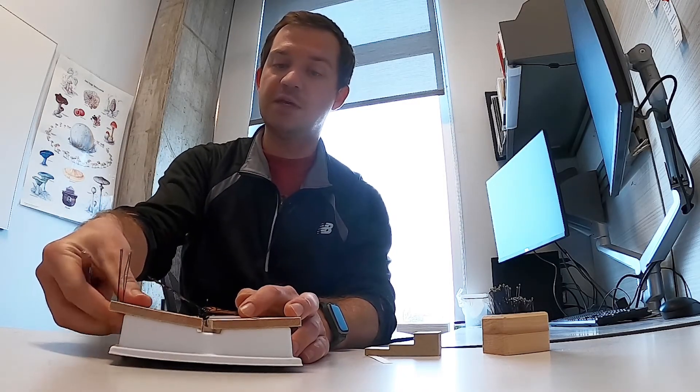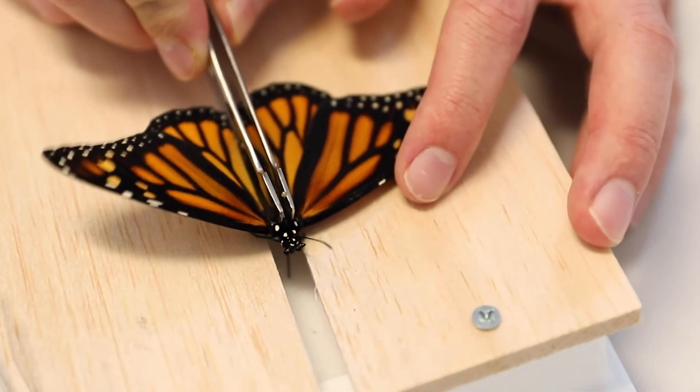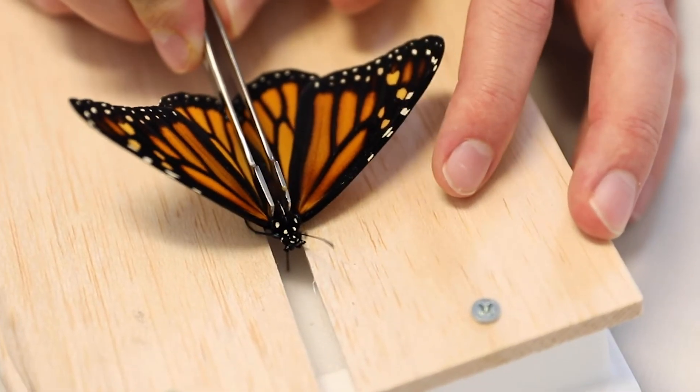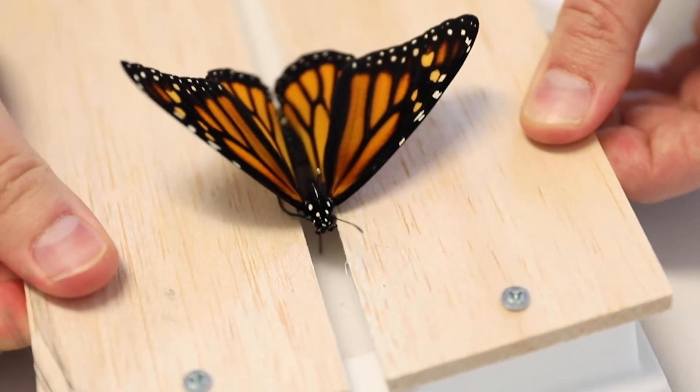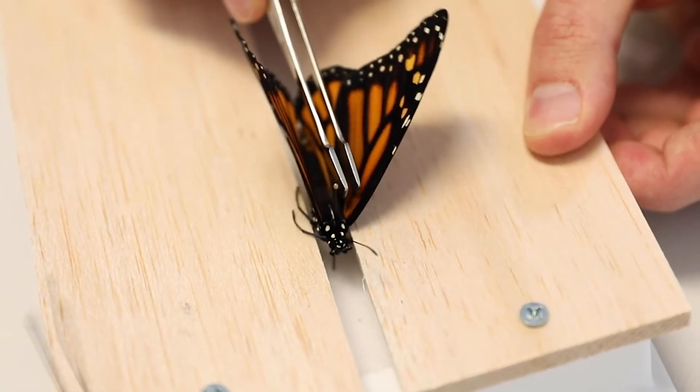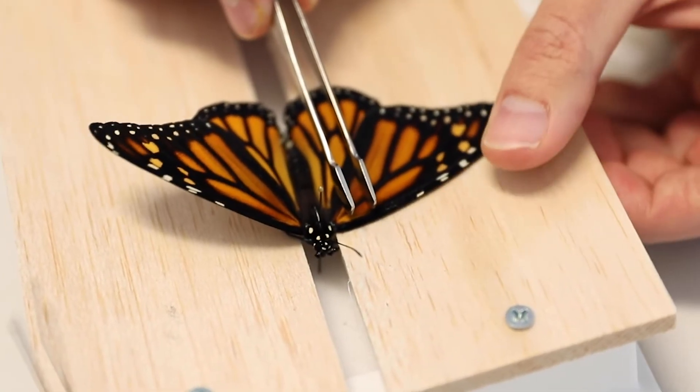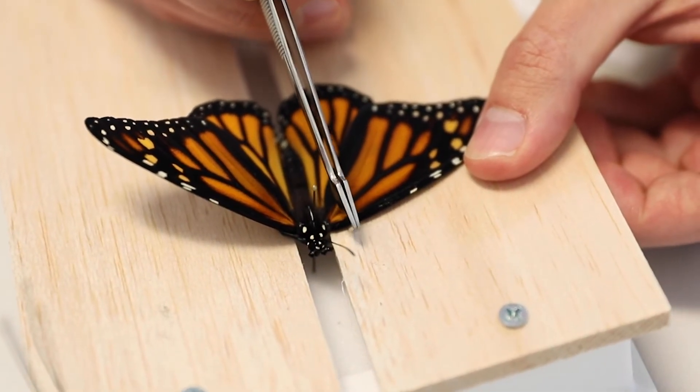What I'm gonna do is take these forceps - you could use your fingers, you just have to be really gentle especially with smaller specimens - and I'm gonna push the body down so that it goes in that little crevice there. I might have to widen this a little bit so the body actually fits properly, and I'm just going to push it down the pin a little bit until these wings, as you can see, are now perfectly flush with the wood top of the spreading board.